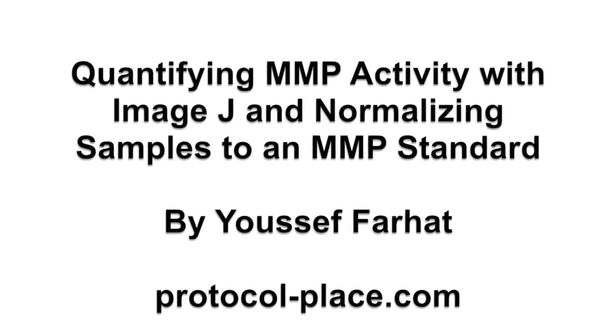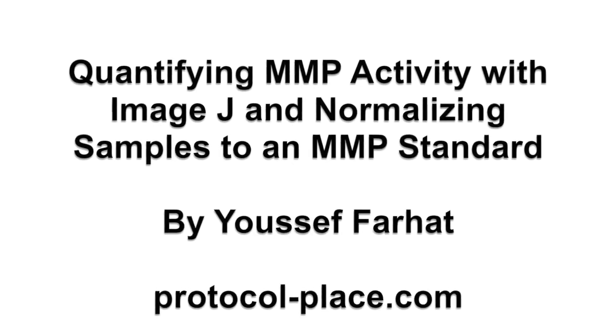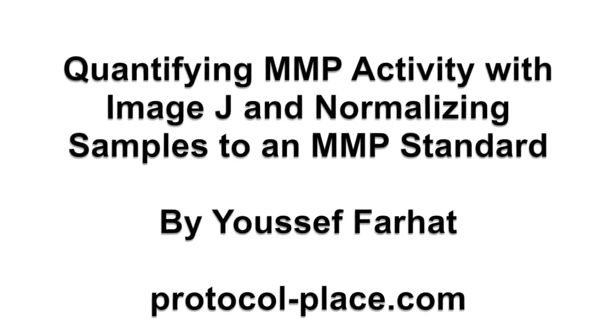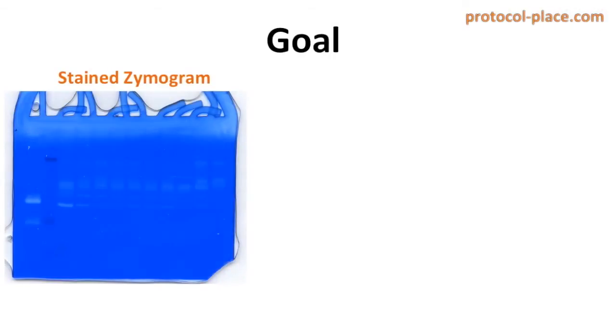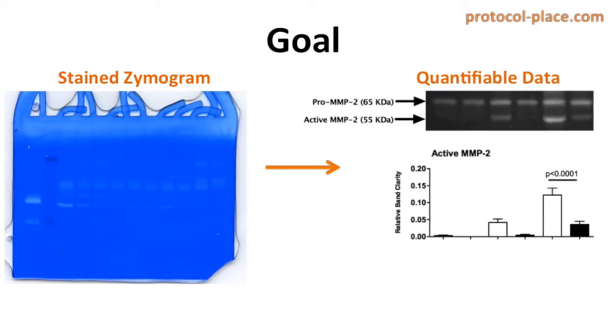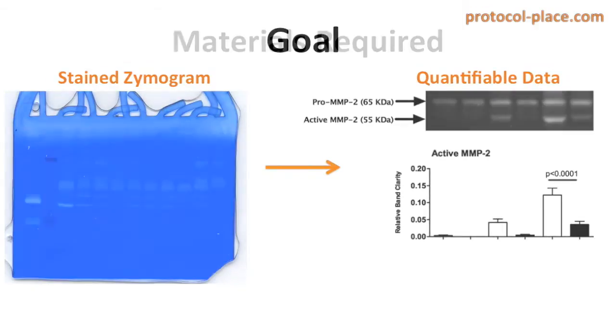Hello everyone, and welcome to our video on quantifying MMP activity with ImageJ and normalizing samples to an MMP standard. The goal of this segment of our series is to show you how to take a stained zymogram like this one and quantify the bands of MMP activity such that you can graph it as shown here.